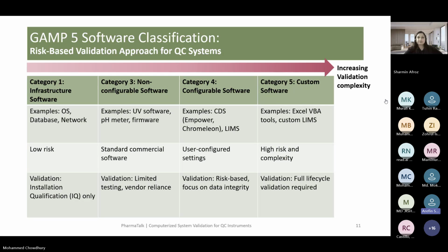I have a couple of questions. Laboratory software systems that we use in some places: we just get the software packages, install them and forget about everything, like updating or repatching. I have never seen an audit for this. I don't know why auditors, sometimes I want to say most of the time, don't audit these things.